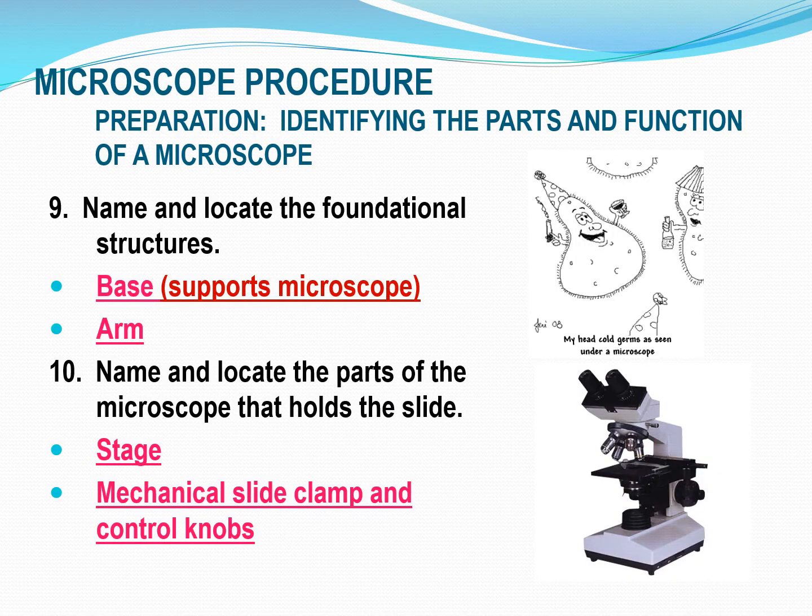Okay, moving on to this microscope procedure, okay? We're talking about identifying the parts and functions of the microscope. And we will go over this in lab with each piece, so I'm going to quickly go over this, but you also need to use this to fill out your review guides. But talking about, and we will in lab, locate the structure.